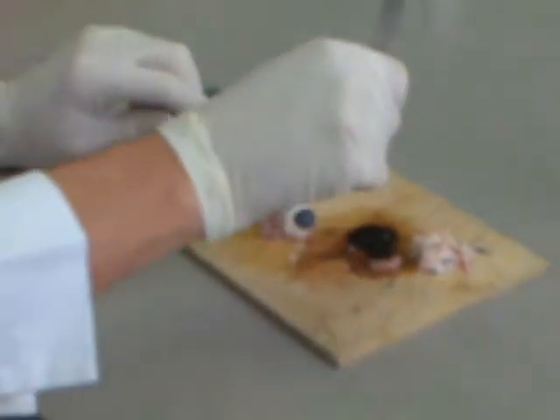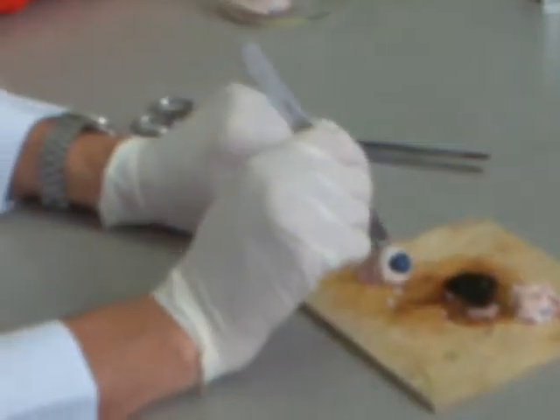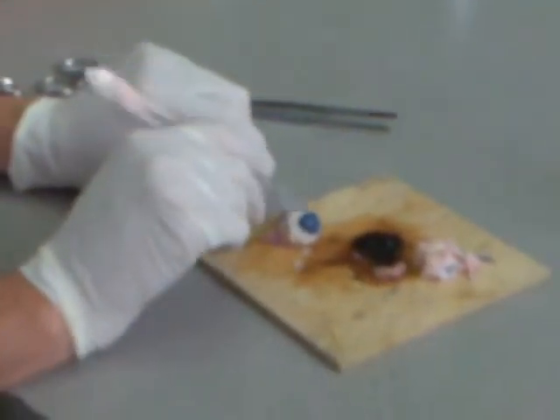So we'll cut this way so we get a section and then we can open it up. We should be able to see the lens at the front and the retina at the top — and hopefully we can see the fovea as well. Hopefully it won't squirt.